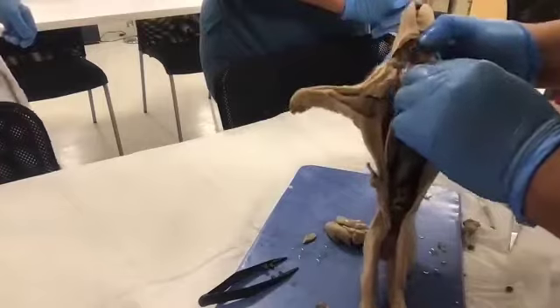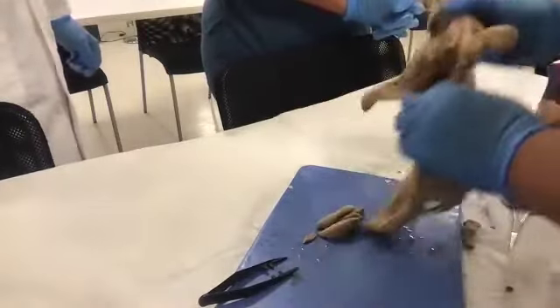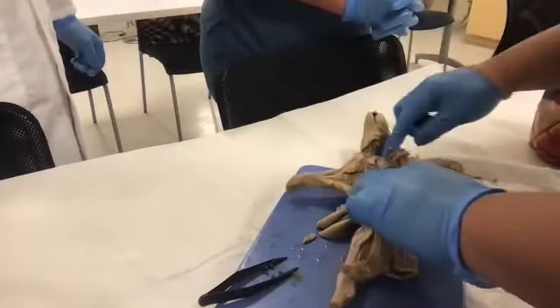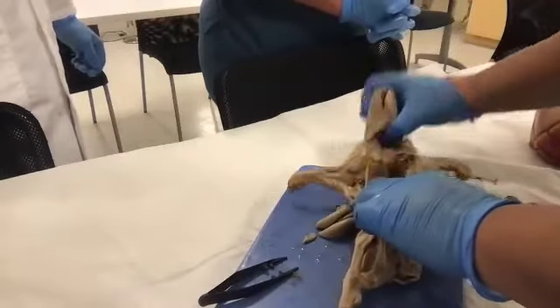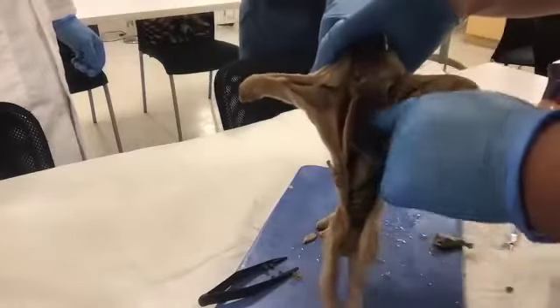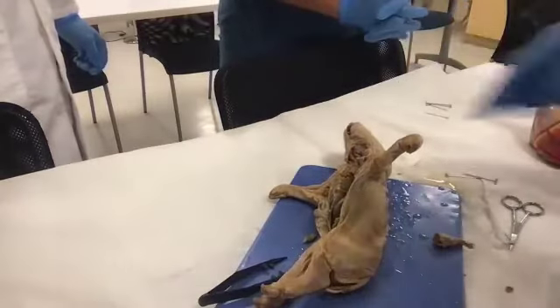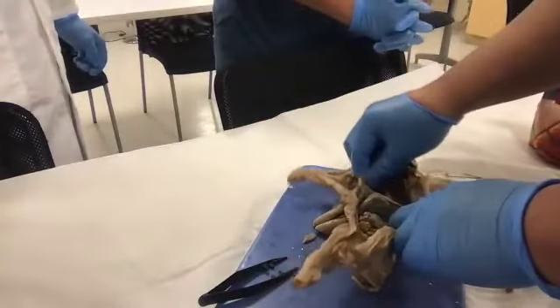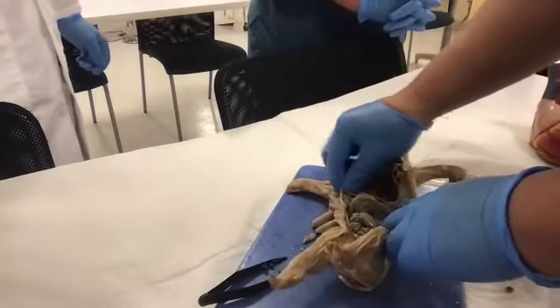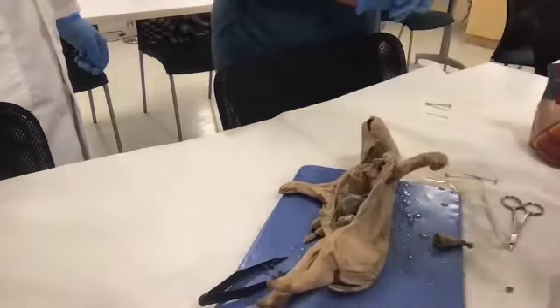Now, you can feel also back here, that's of course the vertebrae. All right. And of course, I know this has to be the cervical vertebrae because that's part of Piggy's neck. And this has to be the thoracic vertebrae because I don't even have to cut open into it. I know there's got to be a connection to the 12 ribs, right? So we feel back here, it's more bony. You feel up here, it's more what? Cartilage. So kindly feel back here and then feel this and tell me there's a difference.